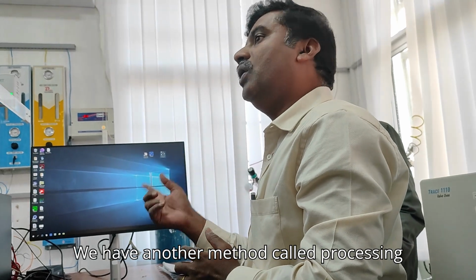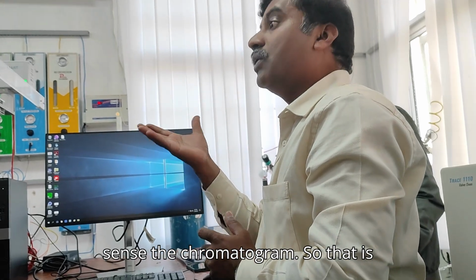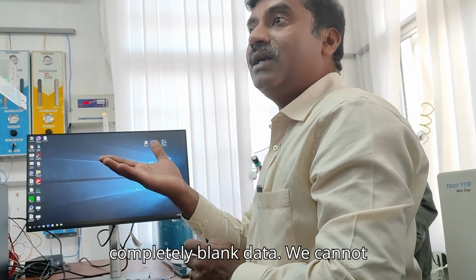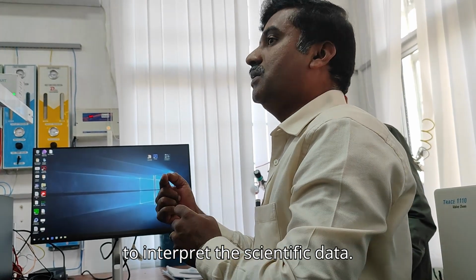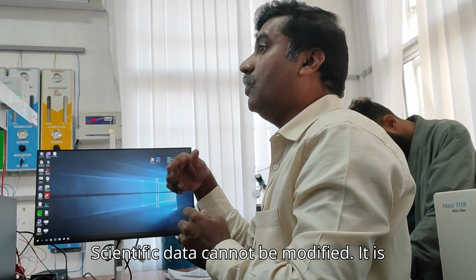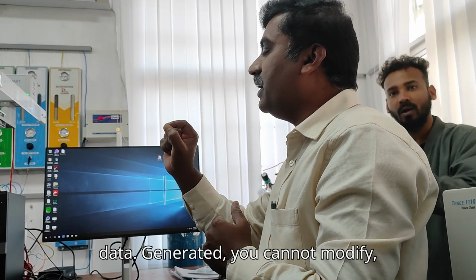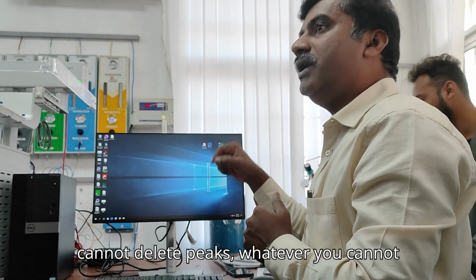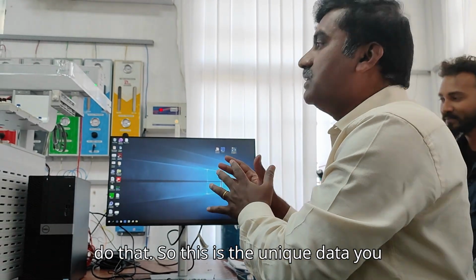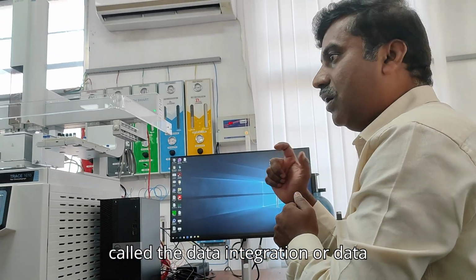We have another method called the processing method. Whatever raw data we receive, raw data in the sense the chromatogram, is completely blank data. We cannot see any information on that. So we have to interpret that scientific data. Scientific data cannot be modified. It is not like our Word paragraph, where we can rewrite and do something. Once the scientific data is generated, you cannot modify it, right? You cannot add peaks, you cannot delete peaks. This is the unique data you need to properly interpret. That is called data integration or data processing.